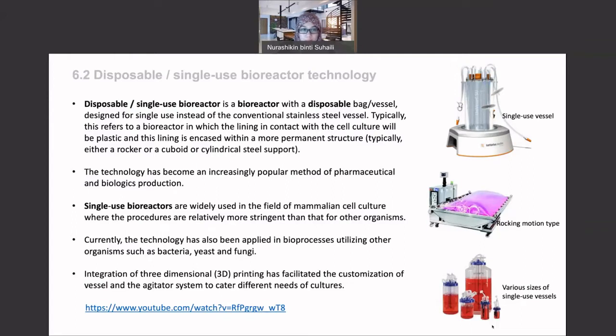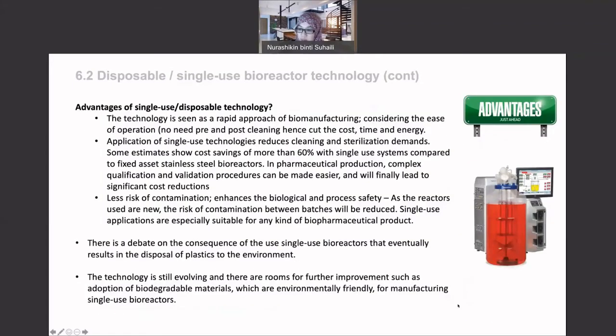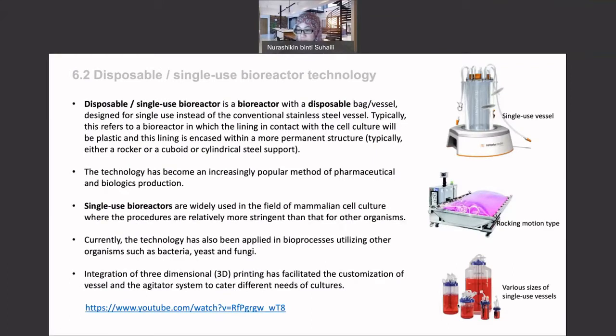Typically, this refers to a bioreactor in which the lining in contact with the cell culture is plastic, and this lining is encased within a more permanent structure, typically a rocker or a cuboid or cylindrical steel support. If you have a look at the pictures on the right here, these are some examples of disposable or single-use bioreactors. The first one is made from plastics, a vessel, as you can see. The second one is a disposable bag, which is normally used for animal cell cultures. And the bottom pictures show various sizes of single-use bioreactors, which are made from plastics.